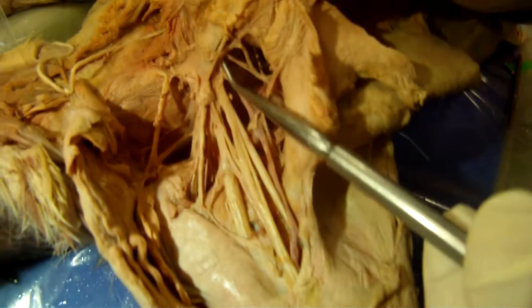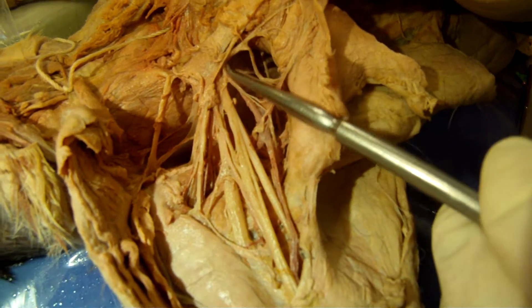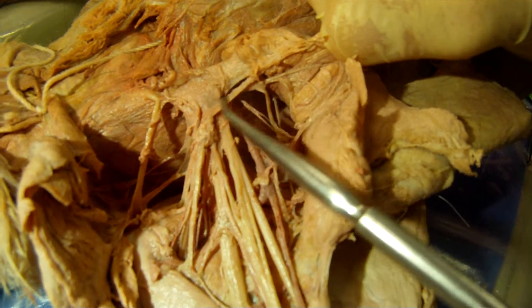This will be the medial pectoralis right here. And this is lateral pectoralis.